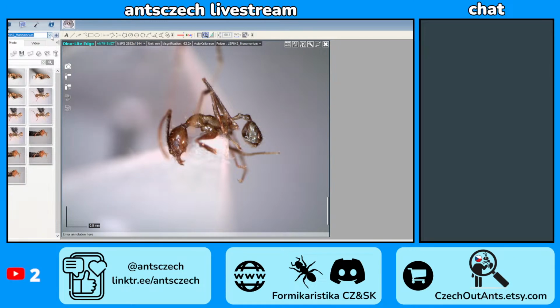What number is this? MJ0210. Pheidole. And it was collected in apparently 2004.